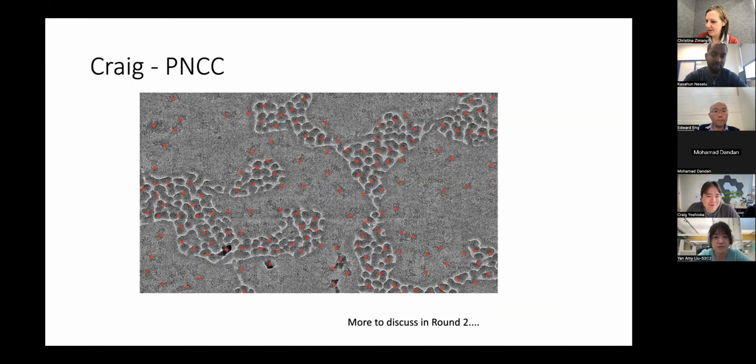I think every time I walk by the microscopes, every once in a while, I'll see stuff that I'm just like, what the heck is that? And this was one of those moments. And I feel like there's so much to discuss in this image if you are familiar with cryo-EM and data collection. But to start it off, I'll point out the obvious thing: those dense blobs in this image that look like devitrified or dried out or eutectic ice.